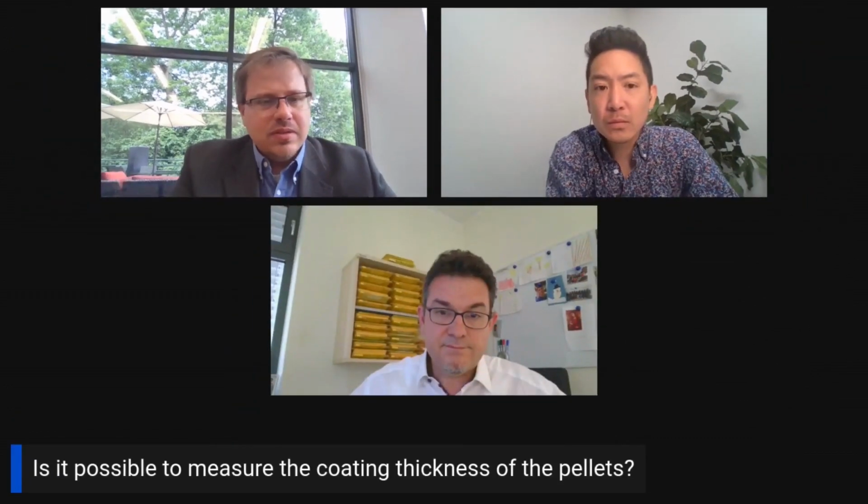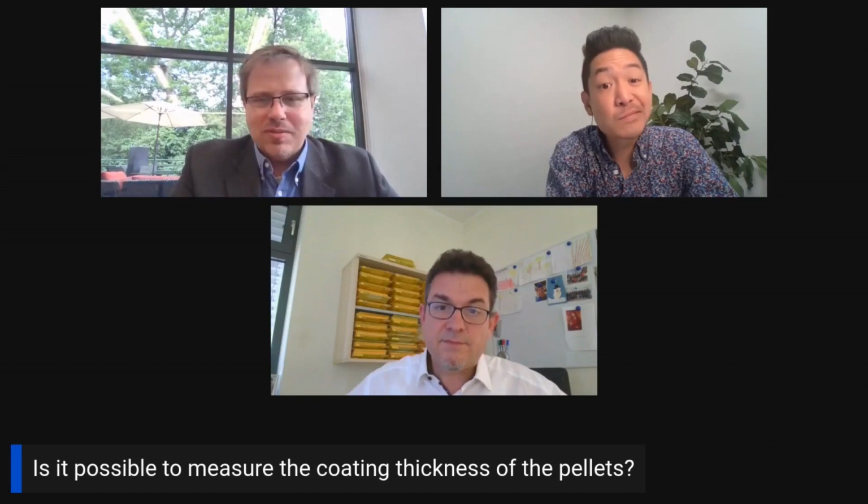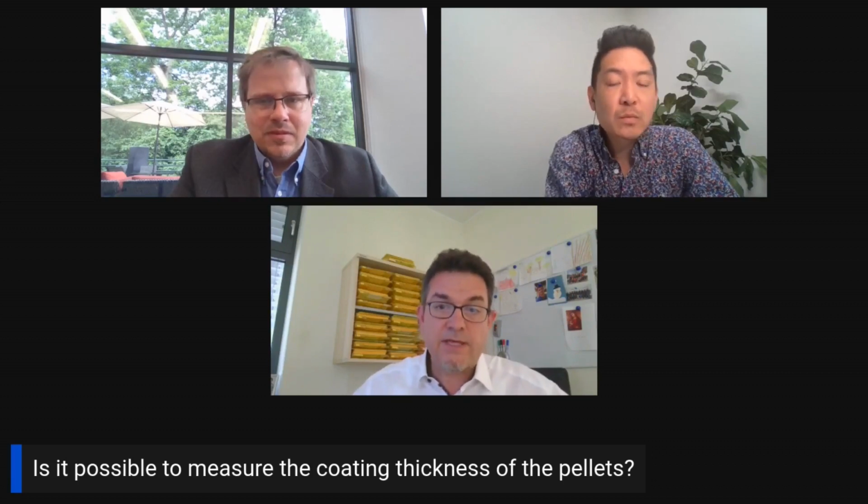Next question. Is it possible to measure the coating thickness of the pellets? I think you may have talked about that a little bit. Yes, that is also very possible, just in the same way as the image analysis I've shown for the coating of the tablets. Yes, we can do it.